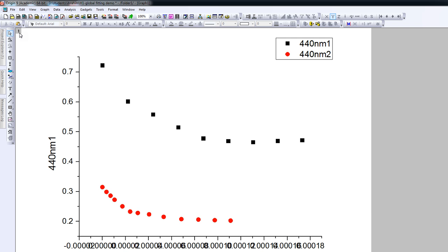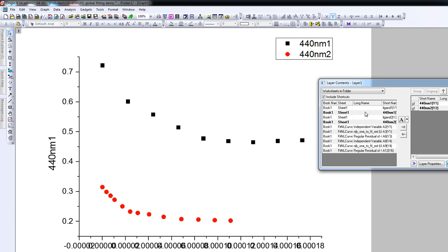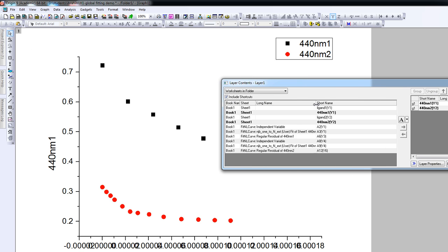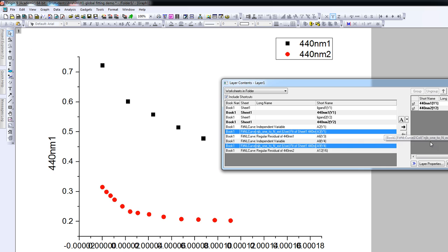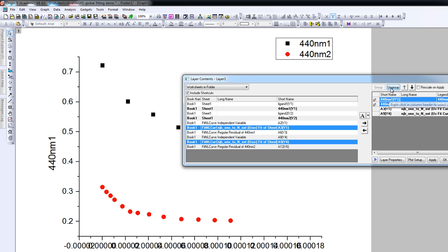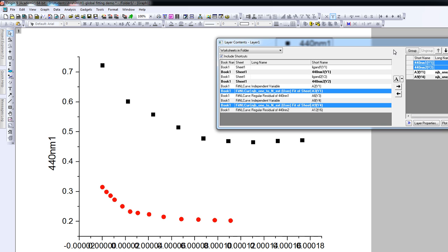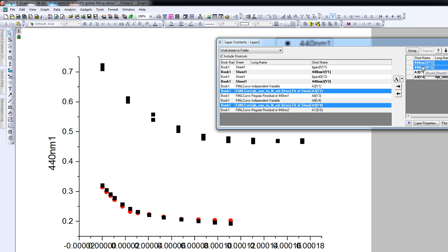If we now go back to the graph and open the layer properties window, we see the available data. What we want to add is the fit for the first dataset and the fit for the second dataset, moving these so they appear in the graph. We also want to ungroup these datasets — if they are grouped, you can't change the plotting style of individual datasets. So we press Apply, and the two fit datasets have now been added.